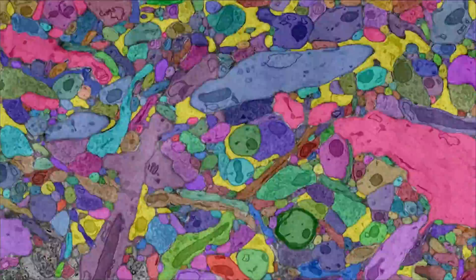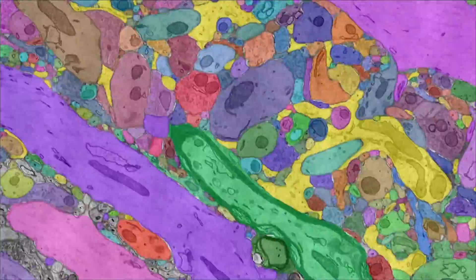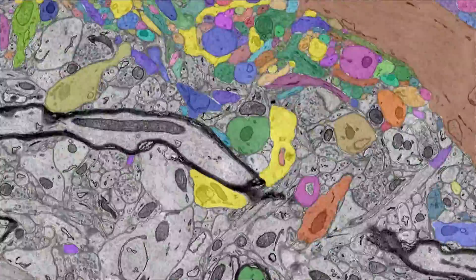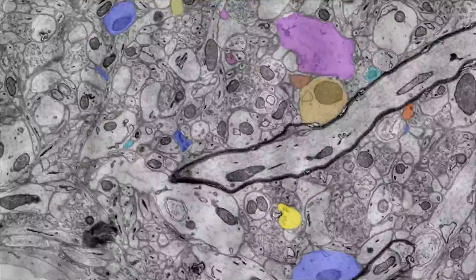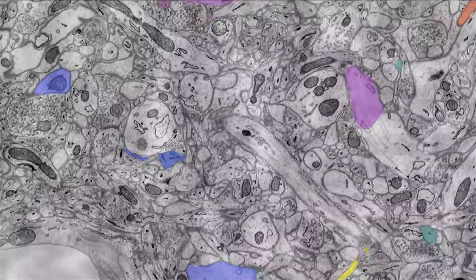For manual segmentation, I wrote a program called VAST, which is essentially a digital coloring book with which we segmented axons, dendrites, synapses and organelles in our volume.